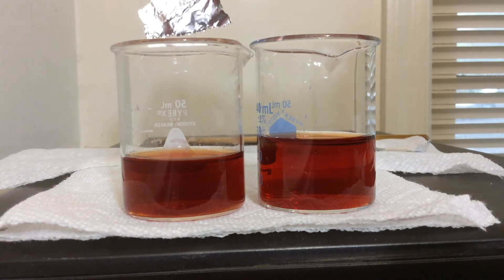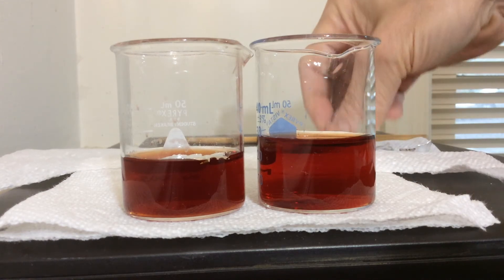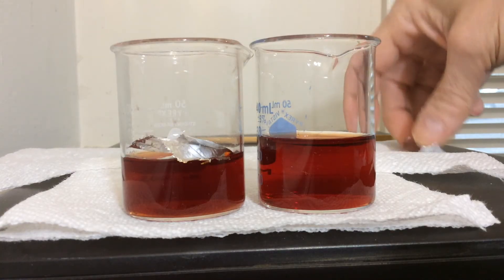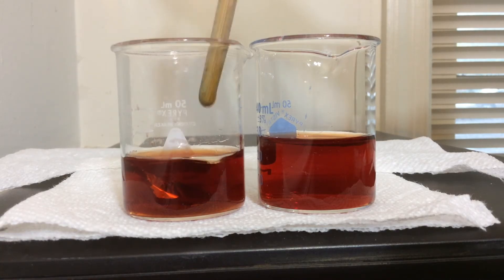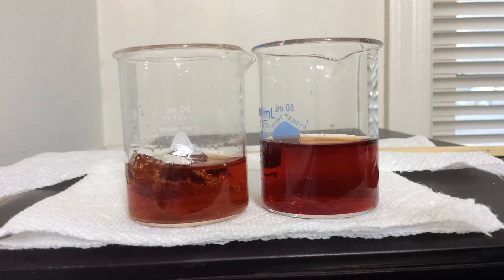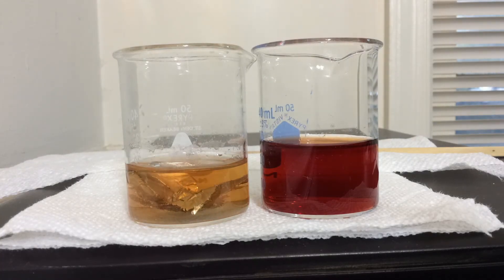I did some research and read about artists using iron(III) chloride to etch aluminum, so I left this out for a couple of weeks to let the iron(II) oxidize back to iron(III) and gave it another try. I can see there is a reaction taking place and the solution is becoming yellow, showing that reduction of the iron is taking place — but will it ultimately become clear?